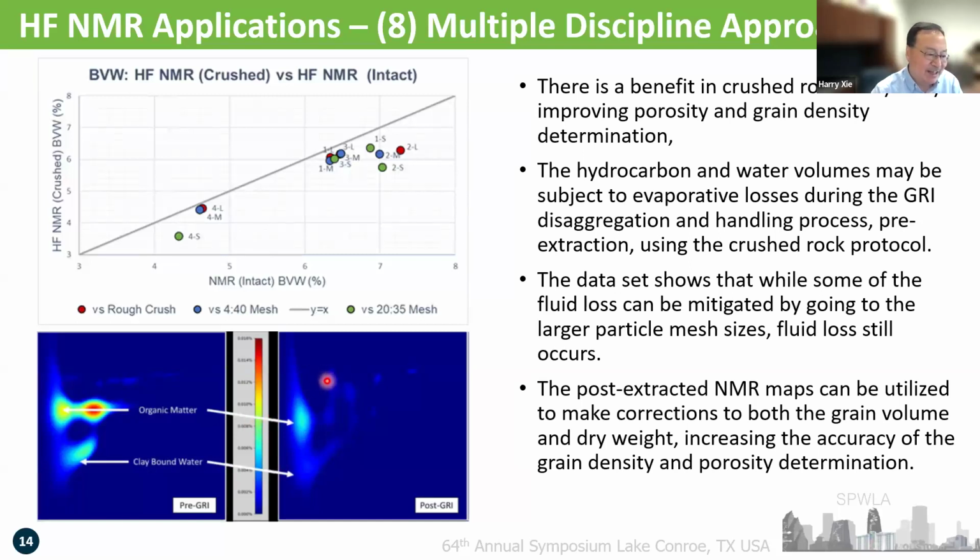So how are you going to judge your Dean Stark method, which is the method to do the saturation measurement? You have to ask yourself a question: is that method reliable or trustable, or do you have to do some modifications? The answer is that we use a combined technology to do this kind of measurement, because the reservoir engineers need accurate porosity, saturation, and permeability data.